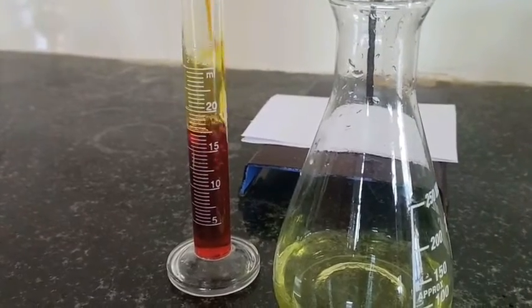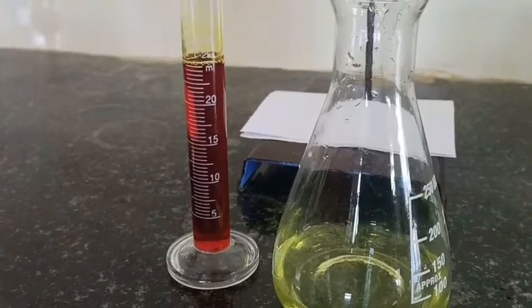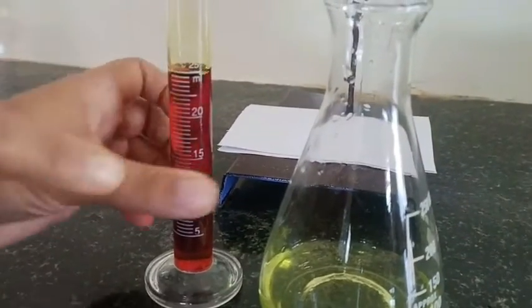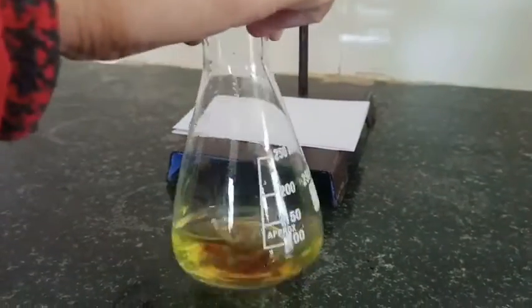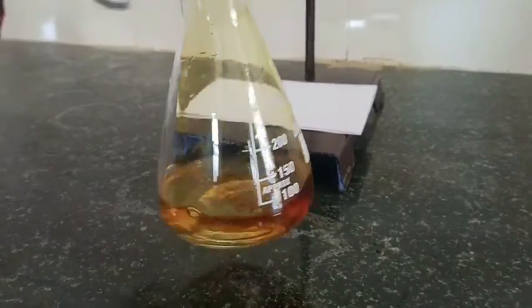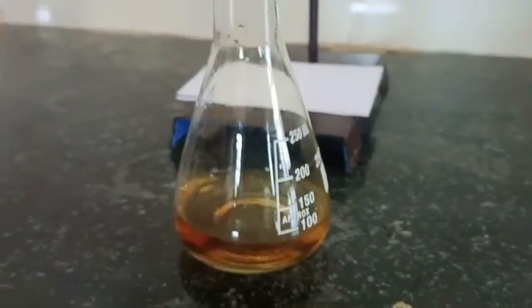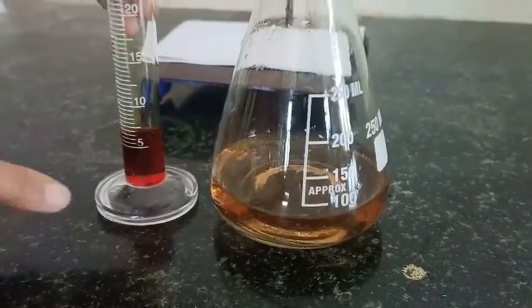Now again we are adding 25 ml of iodine solution to this vitamin C solution, to which we have already added 25 ml of iodine solution. So here I am again adding. You just see, now we get the color of iodine.